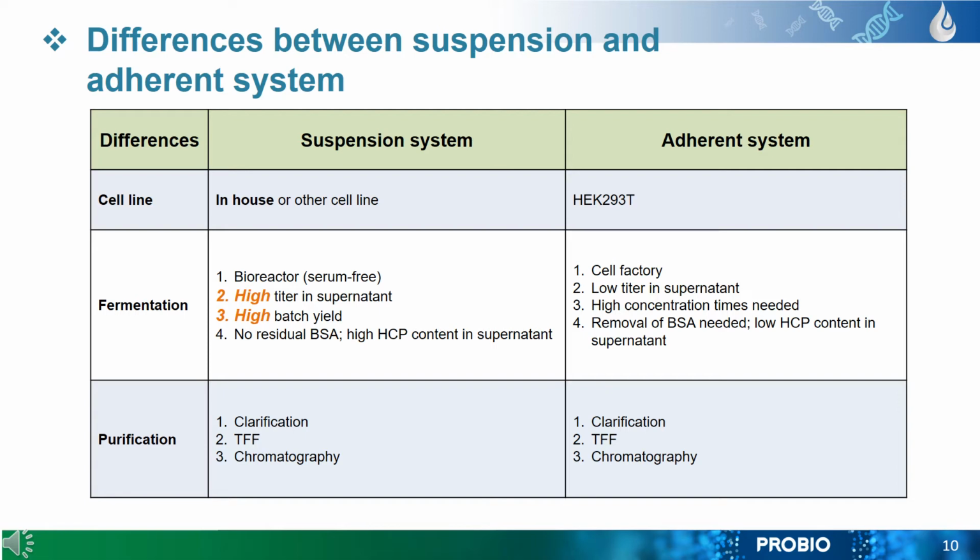This transient transfection method can generate high-titer LVV. However, because of the adherent and serum-dependent nature of the HEK293T cell line, cGMP LVV production is limited due to the need to use multi-stack plastic tissue culture vessels, which increases the amount of handling, personnel, and consumable costs, and production time. Furthermore, the use of animal-derived serum to maintain the HEK293T cell line increases the risk for contamination by adventitious viruses. In addition, obtaining large enough lots of serum can often be challenging and costly to acquire.